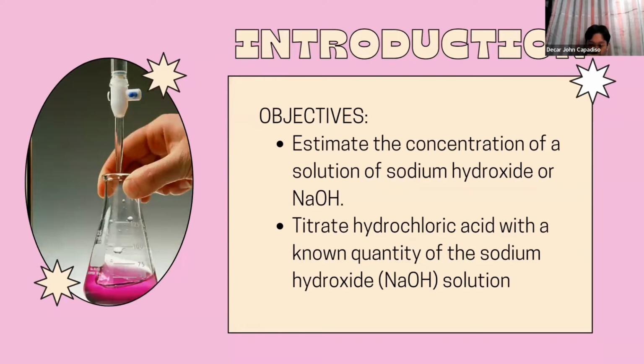Calculations are the foundation of analytical chemistry. Certain experiments are done in the laboratory to gather various data needed for certain purposes. In this particular experiment, our group titrated a solution of potassium hydrogen phthalate, better known as KHP, to estimate the concentration of a solution of NaOH. The indicator we used in this experiment is phenolphthalein. In the presence of excess hydroxide ions, phenolphthalein turns pink.